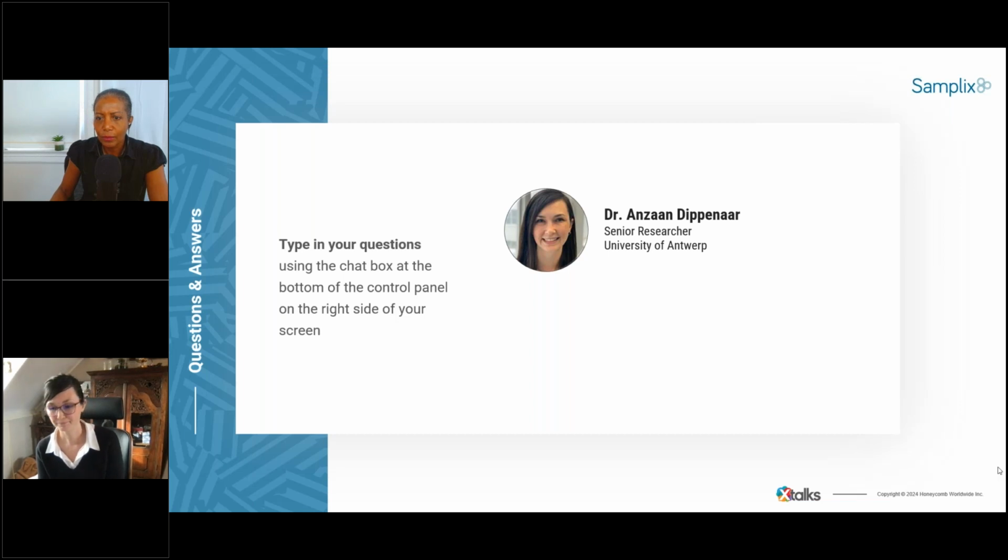So it's something that we look into, and especially, and I didn't mention this in the talk, but especially using the Xdrop sort, it's more of a dream really, but thinking of how we can stain MTB and then in these droplets select for them, and only the droplets that contain MTB to do more enrichment. But yes, that's not something that we've done yet, but really something that we should explore.